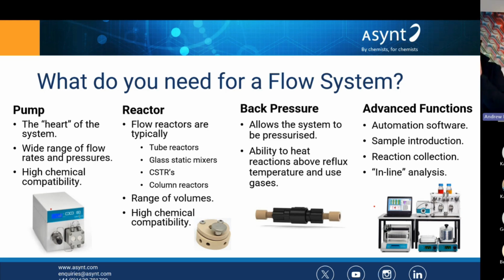And I think the most number of steps I've seen in cascaded or telescoped is 7 or 8, and that was really early natural product synthesis. I'm not suggesting that anyone goes in and does an 8-step synthesis, but it's achievable without any isolation in between. So you can see it can get quite complex, but those simple 1, 2, 3-step reactions with a little bit of optimization are accessible.